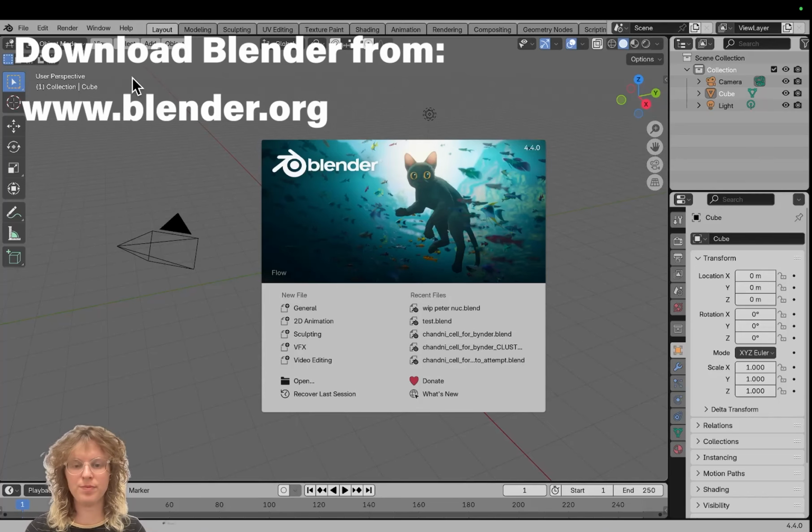Hi everyone. Here we are in Blender. Blender is 3D open source free software that you can download right now, and I'm going to show how to load microscopy data in Blender for 3D visualization with microscopy nodes.